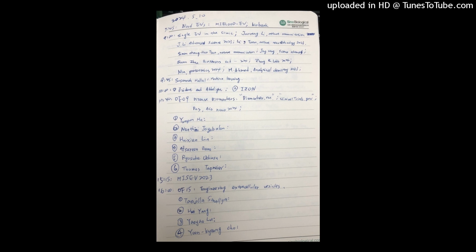So we expected our candidate B to show up here in this lane, which it didn't, and we had a lot of mystery bands here. Not sure what it is, probably albumin or some other common blood serum protein, plasma protein, sorry. We are not that interested in what it is, we just want to get rid of it.